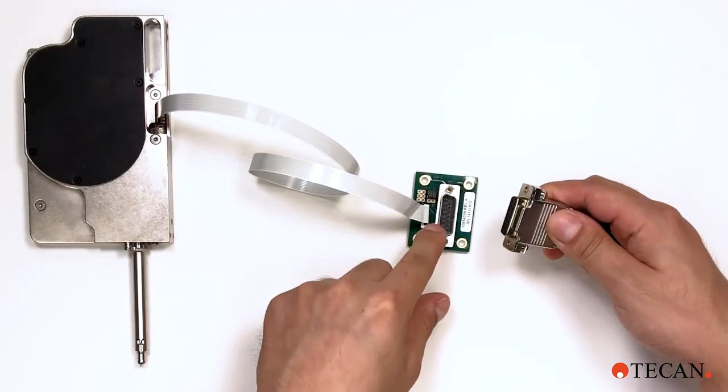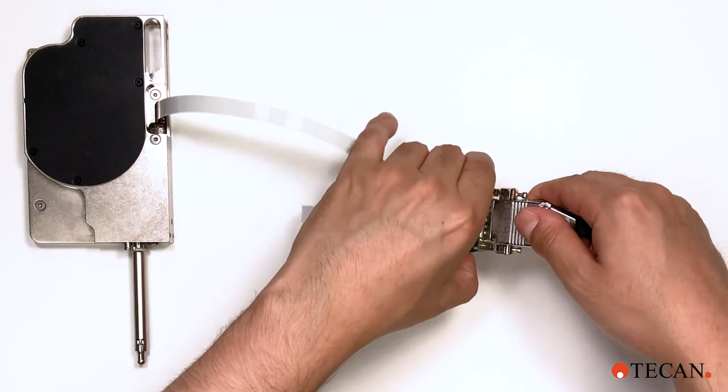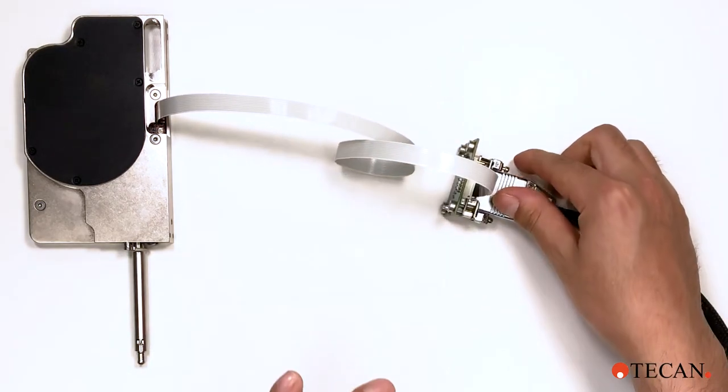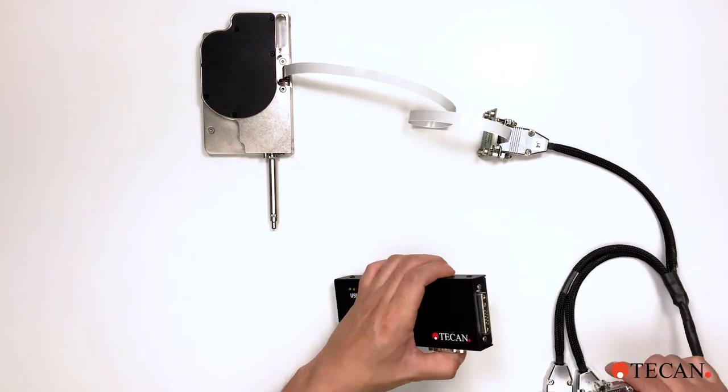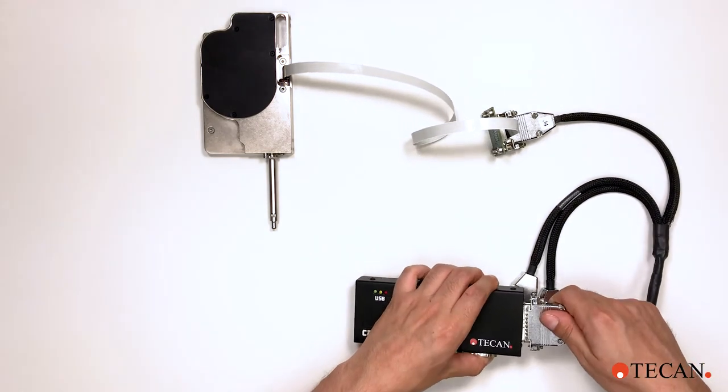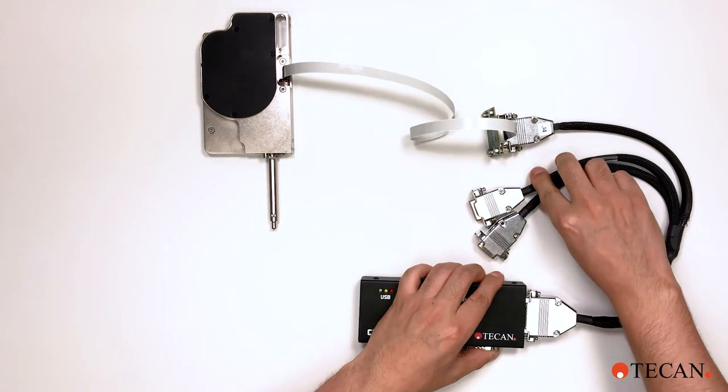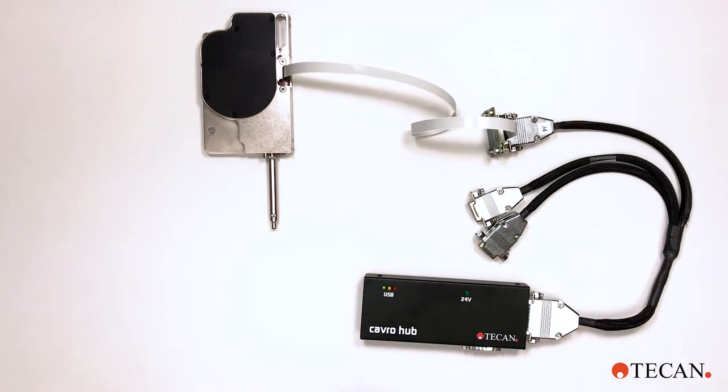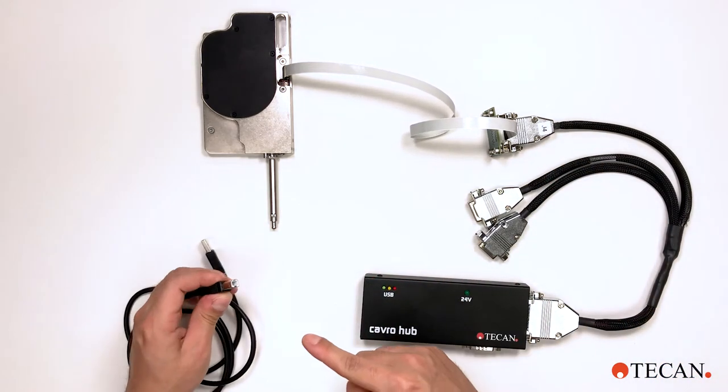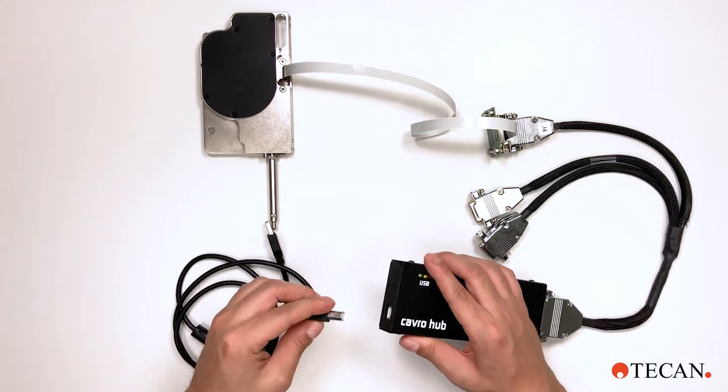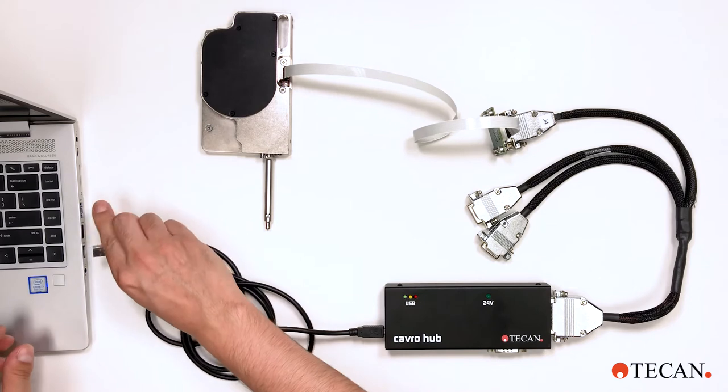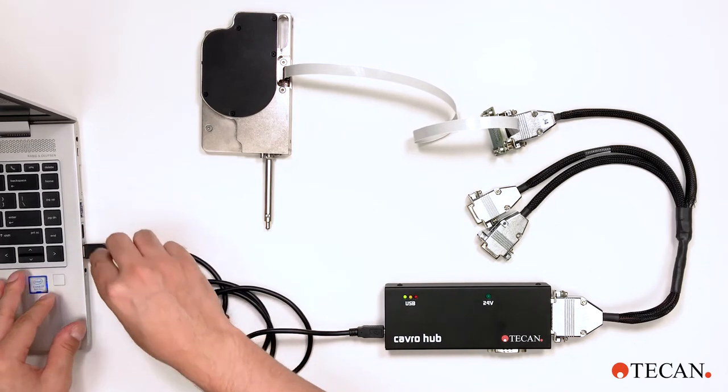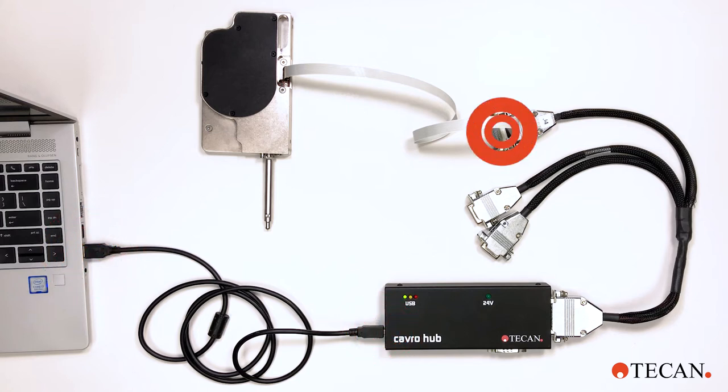Connect the serial bus cable to the CAVRO hub and to the adapter board. Connect the USB cable to the CAVRO hub and to your PC. This completes all connections required for communication: computer to CAVRO hub to adapter board to ADP.